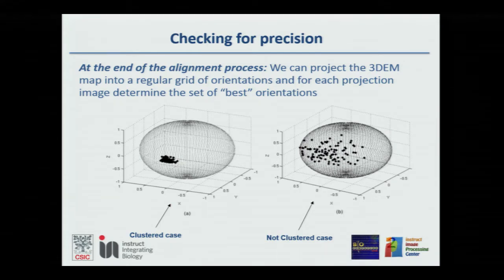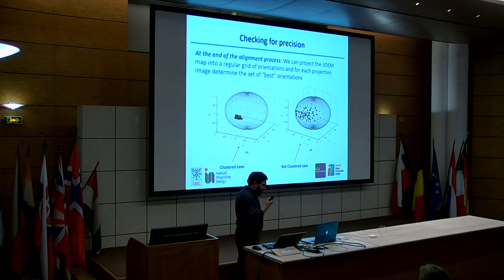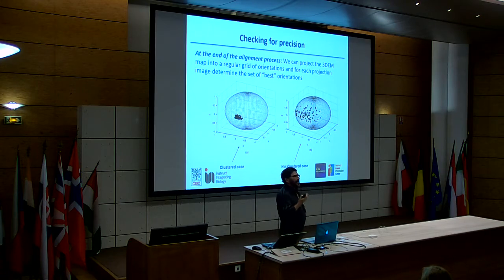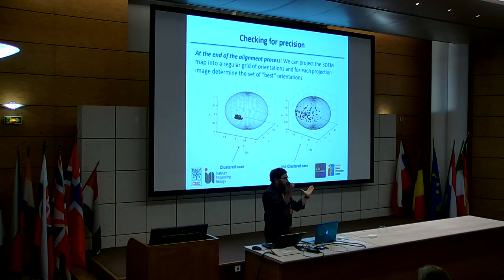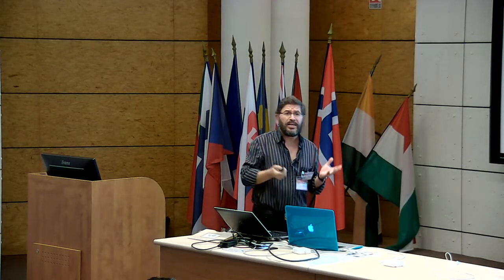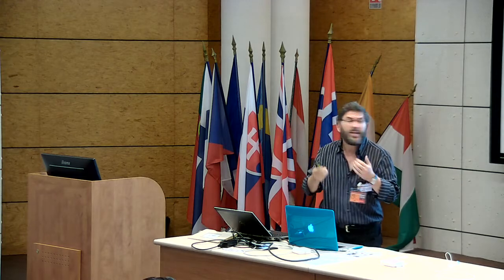That is really how spread out your estimations of something are. Well, recall this thing about the statistical method. What we were saying is, I don't want you to give me as an answer that the way to relate this orientation to this one is this. I don't want one single answer because there is a lot of noise and this is not going to be stable. Give me several answers, perhaps with proper weights, things like that.